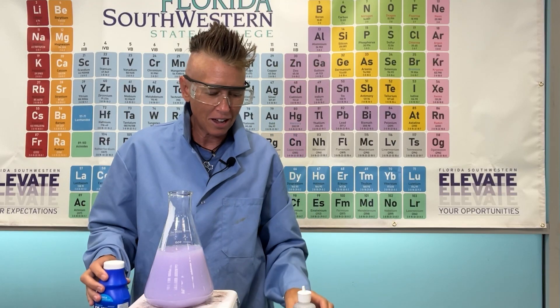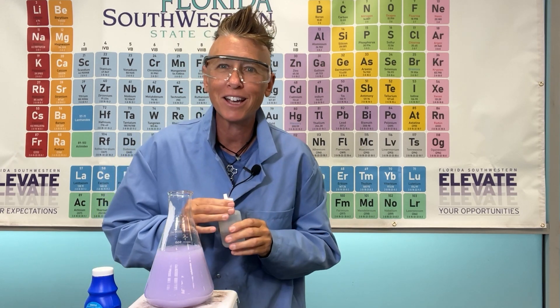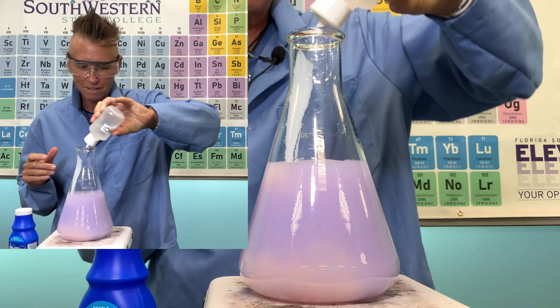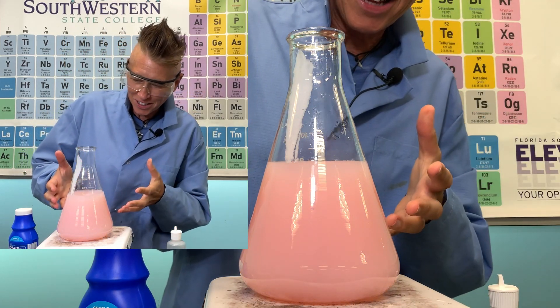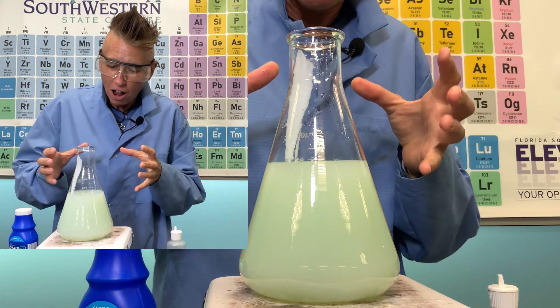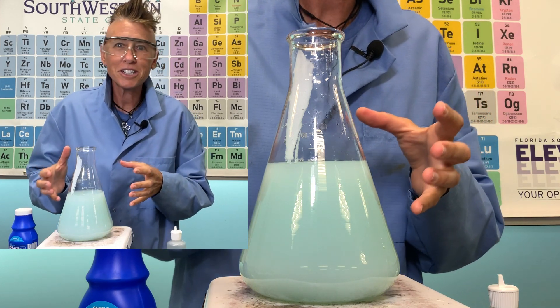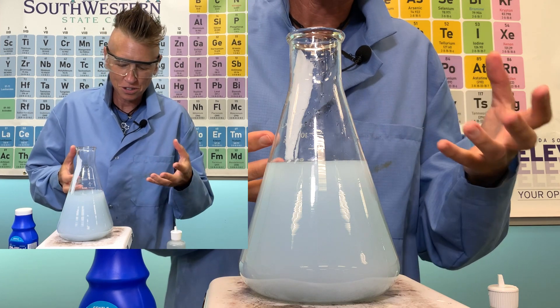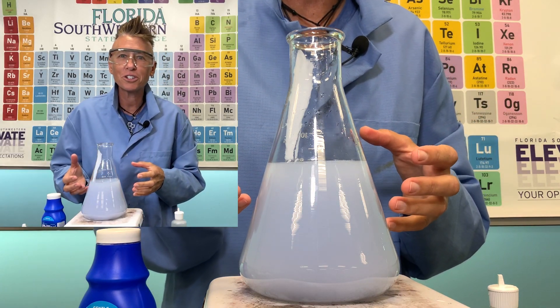So let's take a look at adding a little bit of stomach acid to my milk of magnesia — I'll just do a little squirt. There's neutralizing. And then we look — wait a minute. It didn't stay neutralized. It didn't stay acidic. It actually went back to the original color.